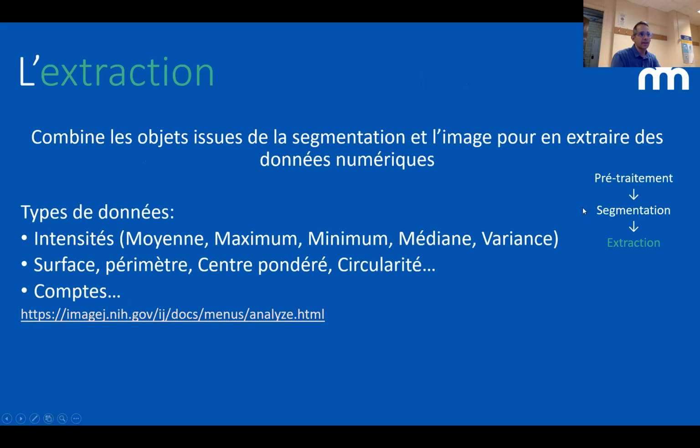The last topic of this session is about extraction. And the good news is that it's actually fairly easy. Once you have done the cleaning and the segmentation, then the extraction is only bringing the segmentation region of interest back to your image to extract some data.